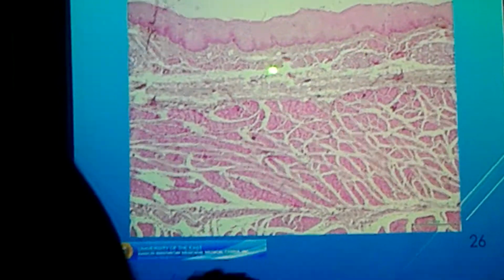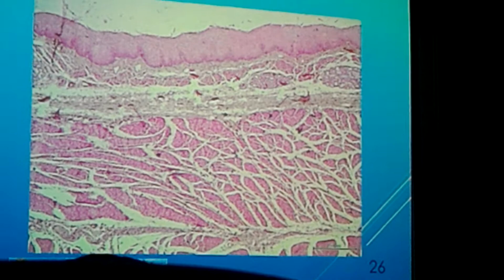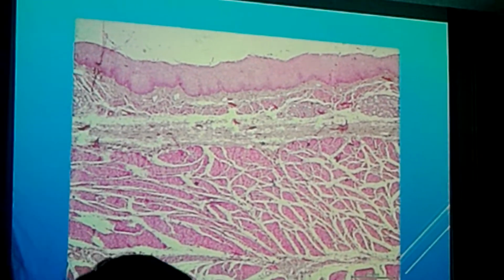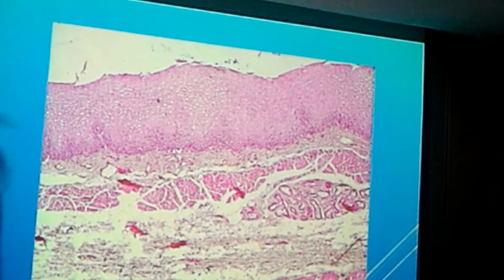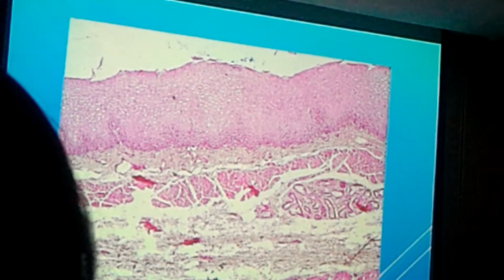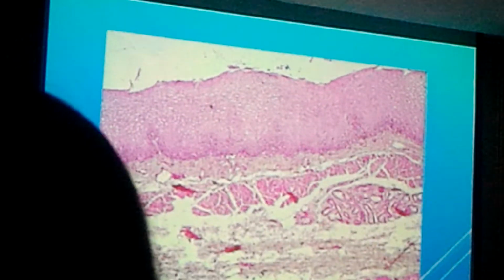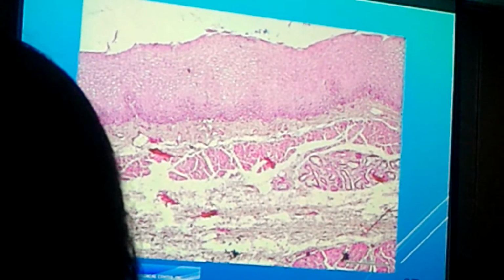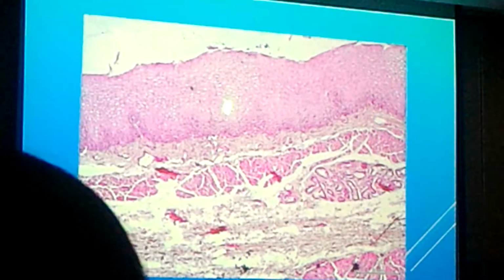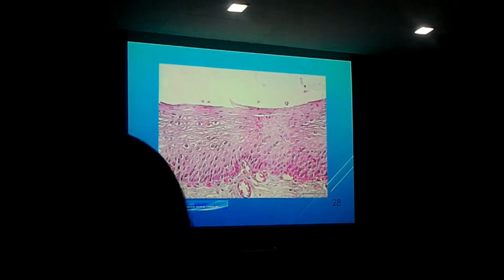Again, you will have your lamina propria, your muscular area, but this is our concern. Parang unoccupied. This is your epithelium. This comes from your esophagus. Classify, class. Stratified squamous, non-keratinized, or wet type. You can use the wet type. Non-keratinized or wet type. So it's stratified squamous epithelium.